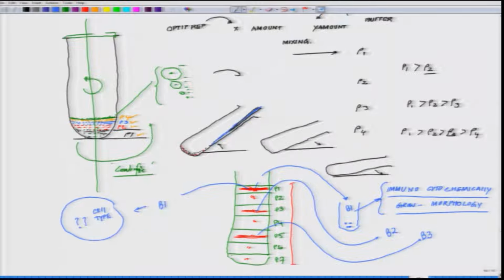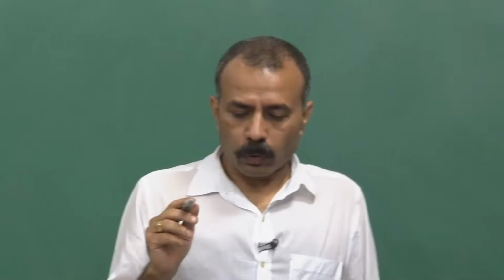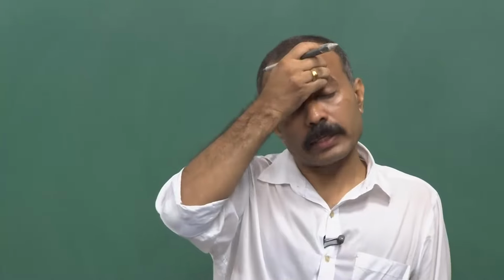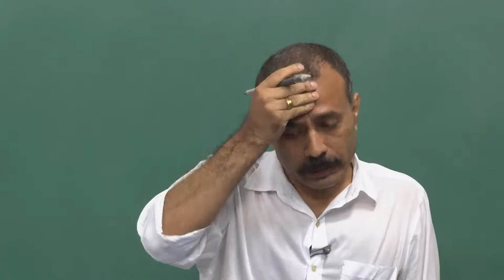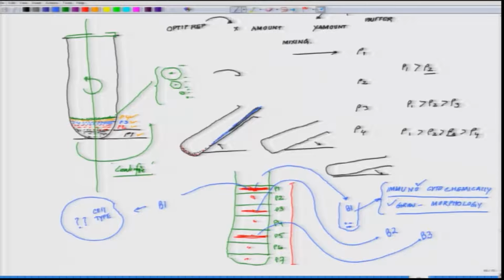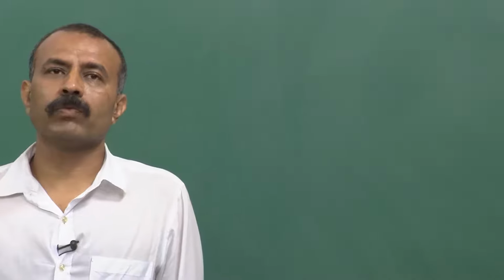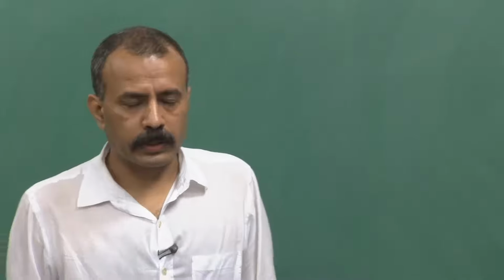So, these are some of the technologies which have been achieved over the years, like the very first technology. I'll come after the hippocampal neuron, I'll come to the spinal cord neuron, where you have to separate out the oligodendrocytes and several other cell types there. I'll come to that. Okay. So, what I wanted to highlight here is that these are the basic technologies and the follow-up technologies one has to master before you achieve the goal of developing the defined systems.